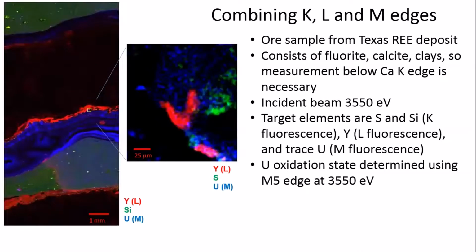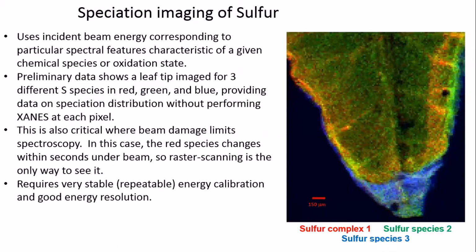Okay, so in samples, typically at sulfur for a XANES measurement, a spectrum takes about 30 seconds. And then we collect multiple spectra to average to get good statistics. So we monitor changes from scan to scan to look for beam damage.